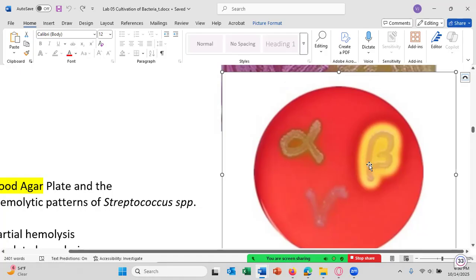You can actually see through the clear region. You can hold this up to the light and see the light bulb through the clear region. I sometimes hold it up to the clock and then try to tell the time because you can see through the clear region.